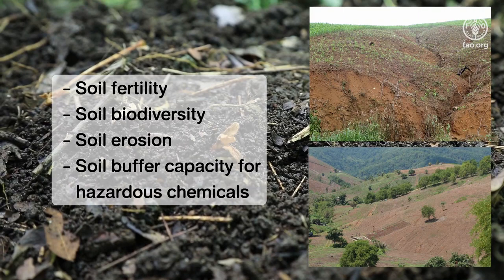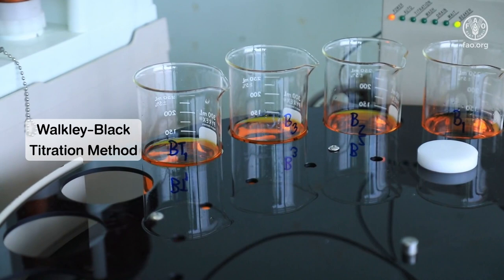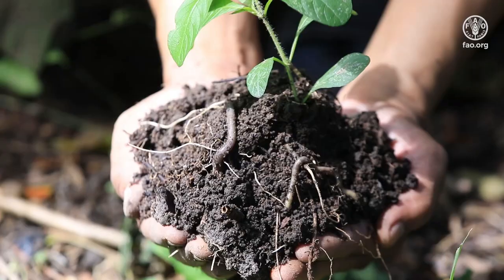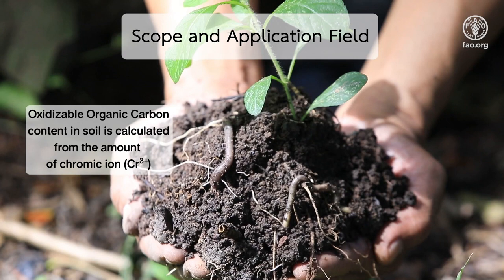In this video, we will show you how to quantify soil organic carbon using Walkley-Black titration method. This protocol allows you to determine oxidizable organic carbon content in soil, calculated from the amount of chromic ions formed during the reaction.